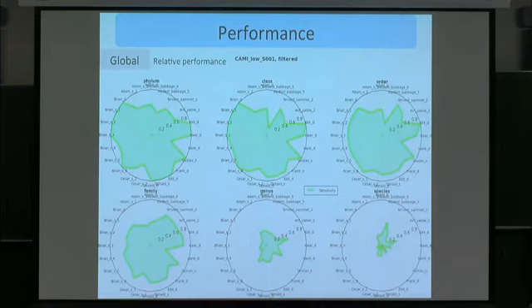Modest Babbage 5 is not the best at sensitivity at the class level, and it's not the worst, so it's somewhere in the middle. Once again, the same thing you observed below the family level: they do poorly. Notice how big these are, and then all of a sudden they jump way down.